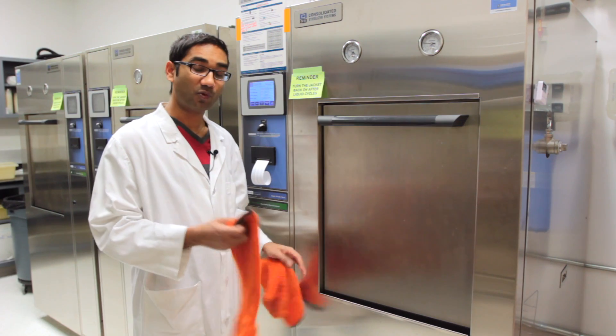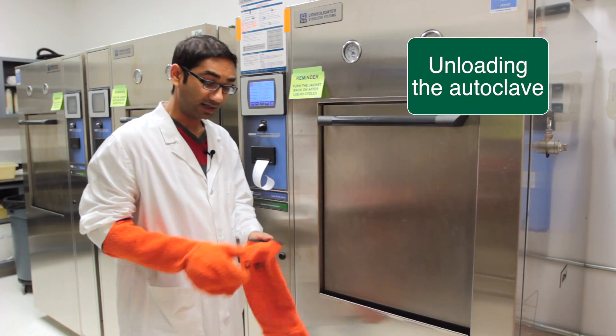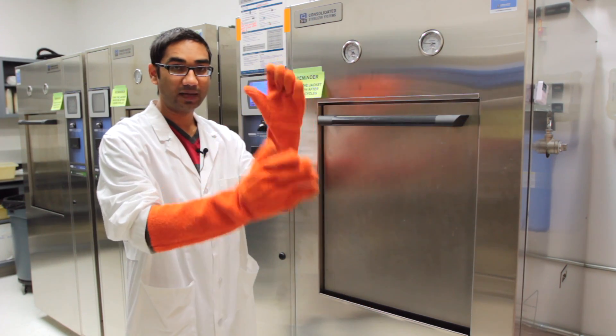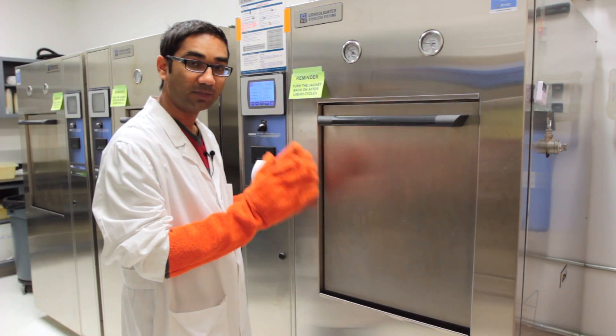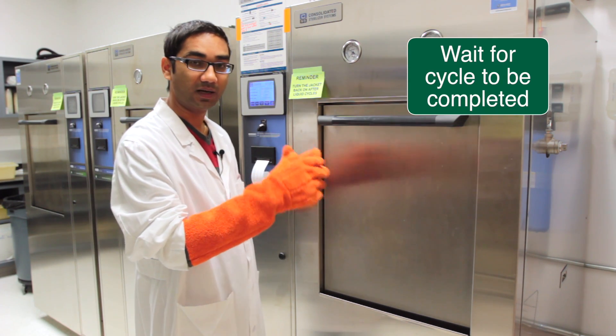At this point we are going to be unloading some biohazard bags that have already been decontaminated. While doing that, we have to make sure that we are wearing long sleeve gloves because we do not want to burn our hands. After the cycle has been completed, we have to wait a couple of minutes to let the steam run out.